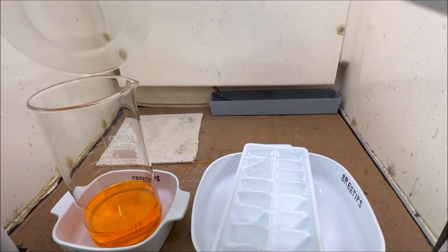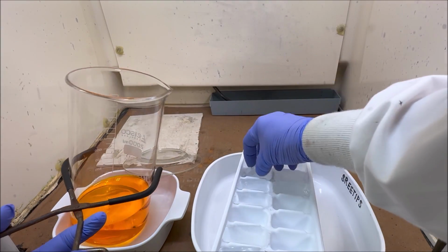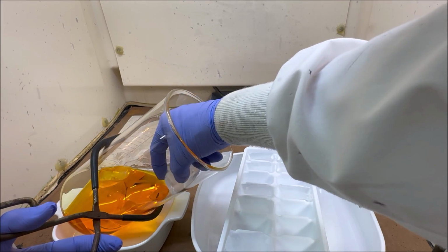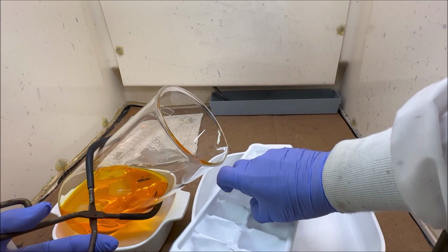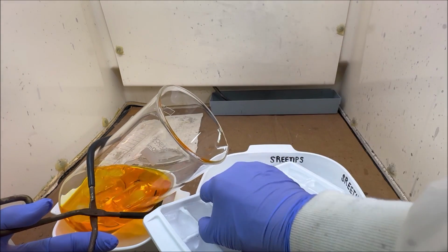Cool this down so we can filter it. Look how clear and bright that solution is. It looks absolutely gorgeous. No traces of cloudiness. Beautiful chloroauric pure gold solution.